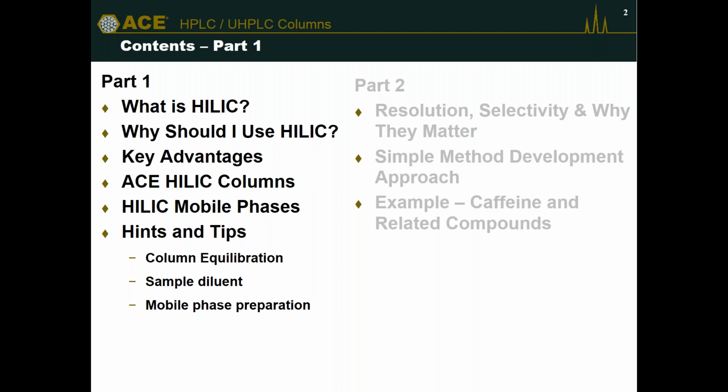This is an important subject, and it's something that's quite different to reverse phase chromatography, which many people are familiar with. And I will go through some of that in detail. And then secondly, sample diluent. So many chromatographers use a variety of different diluents and solvent systems when they're developing their methods. Now, HILIC is a technique where we need to have different considerations, and I'll cover some of that today too.